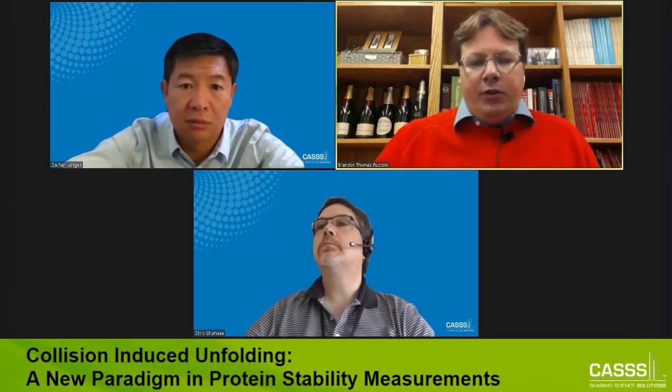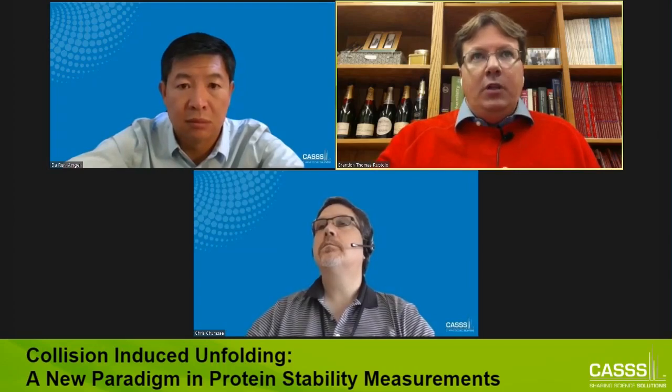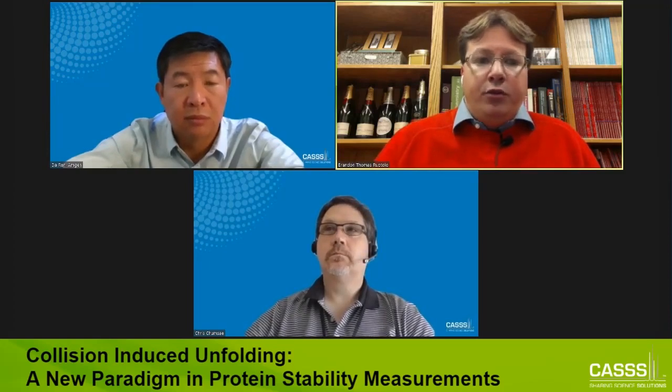Yeah, so we do observe some differences. They mostly manifest as differences in the cross-sectional areas of the features that we record, and some differences between the transition voltages. And it's really hard to compare transition voltages between the two platforms mentioned there, because they exist in different pressure regimes and different voltage regimes. So cross-comparing is very, very challenging.